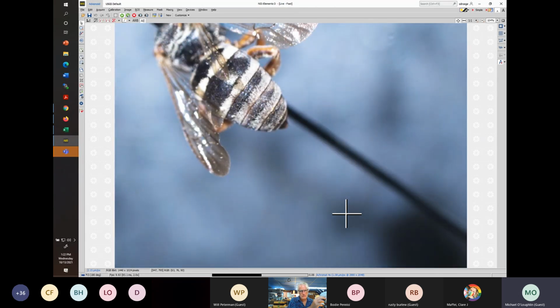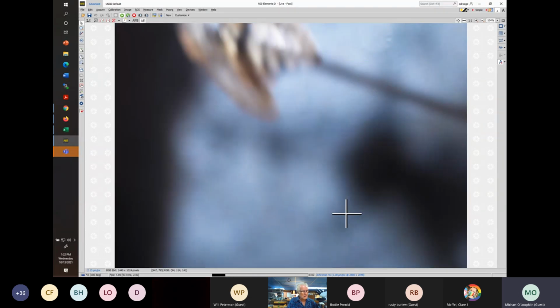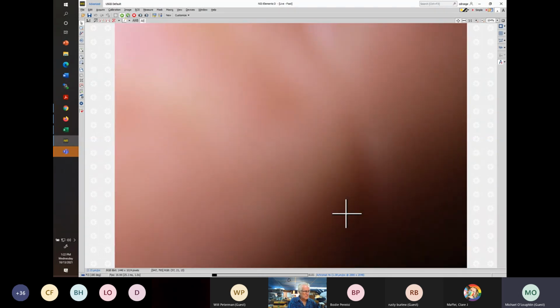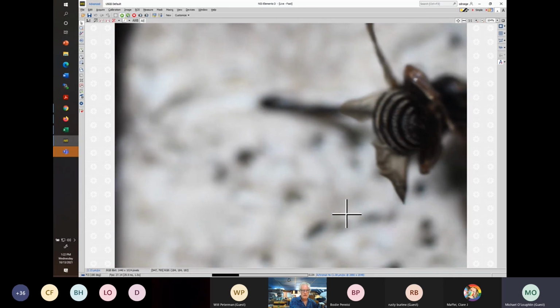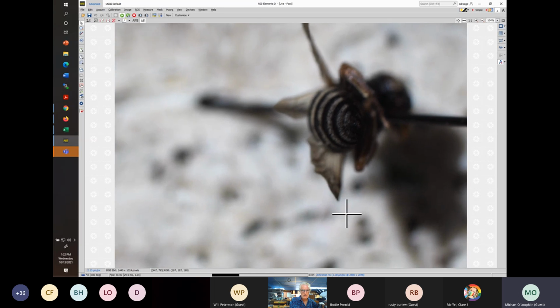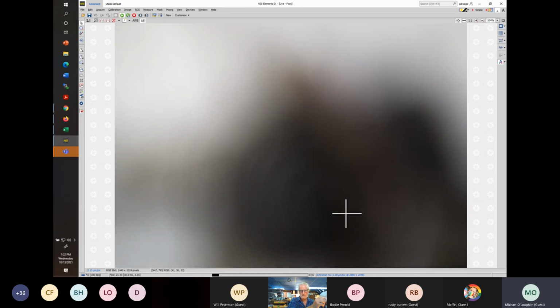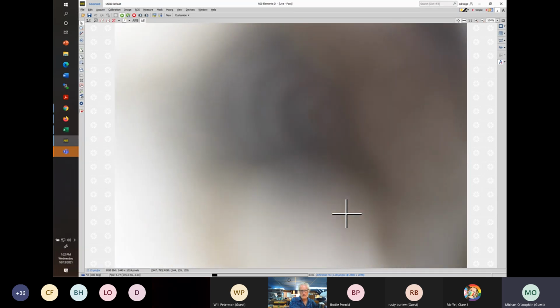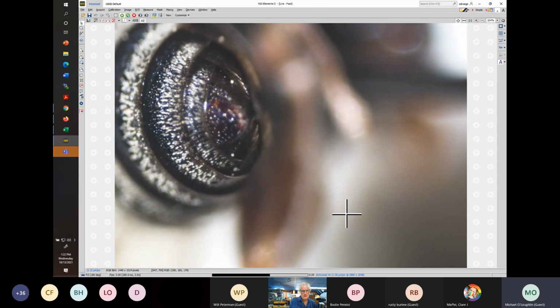We are going to, it's a male, and you can already see that in this specimen, the pseudopygidial area. Is that going to show? Hopefully it'll lighten up when I bring the specimen up to, yeah, here we go.